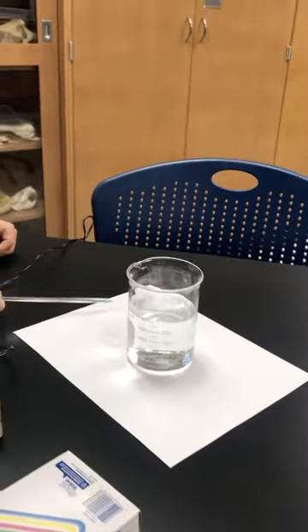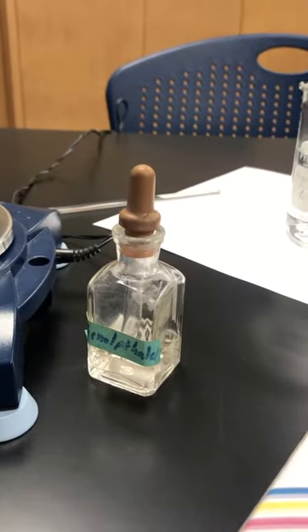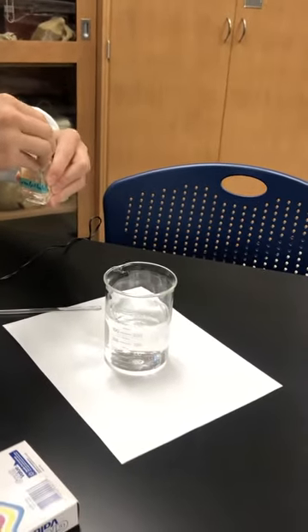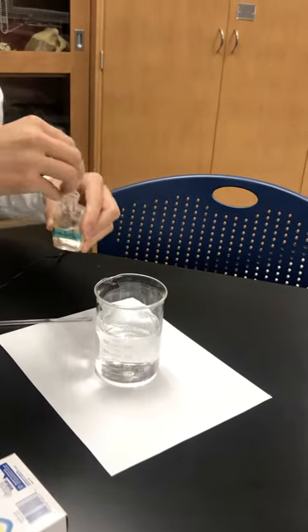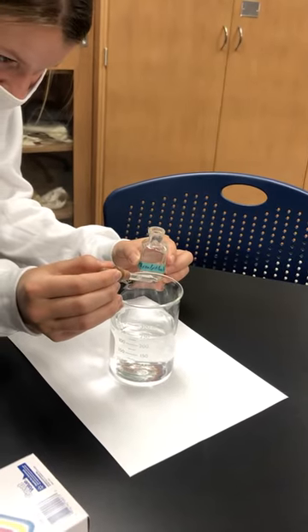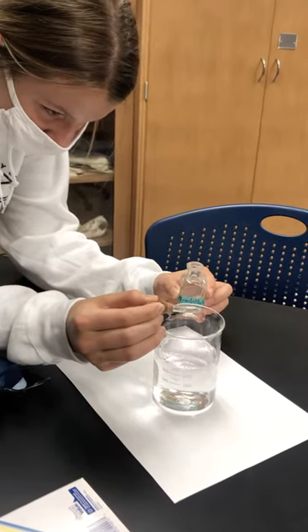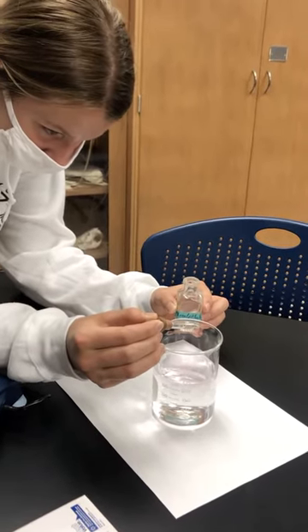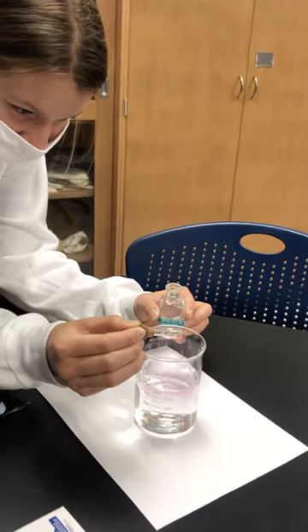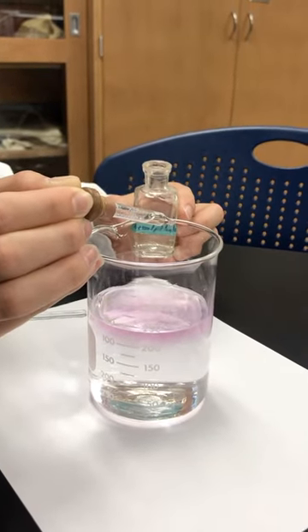Now what she's going to do is add 20 drops of a substance called phenolphthalein. So she's going to use a pipette, and she's going to drop 20 drops of phenolphthalein into the solution of baking soda and water. Phenolphthalein is an indicator. It's a color indicator. So in a basic solution, phenolphthalein is going to turn bright pink. And you can actually see it starting to tint pink right here in this solution.